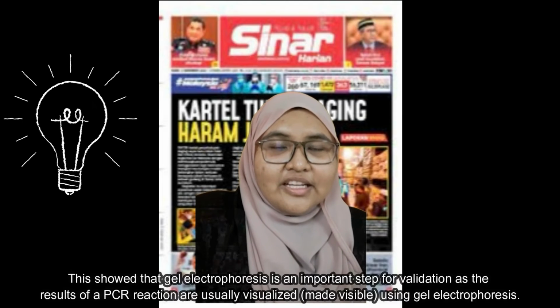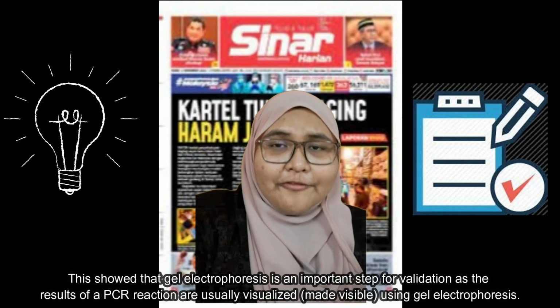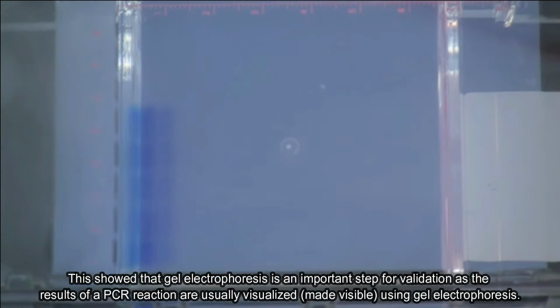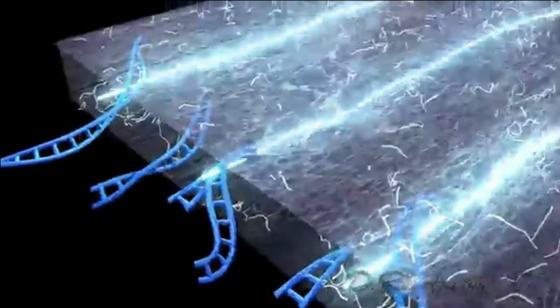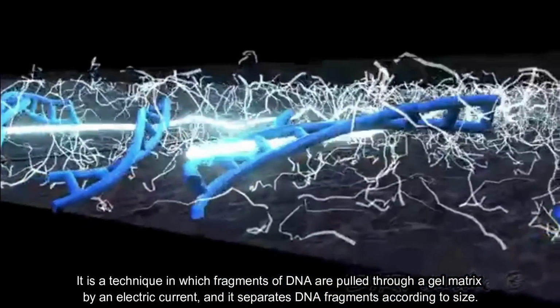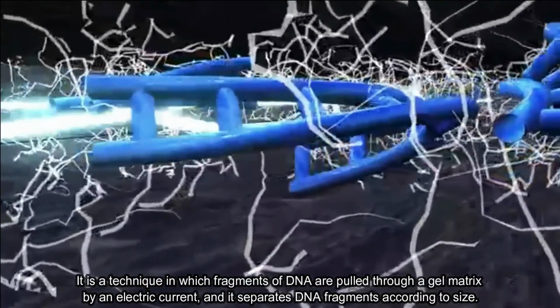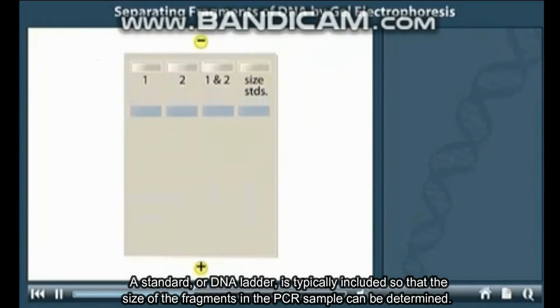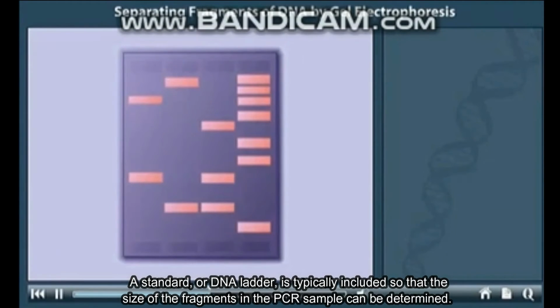This showed that gel electrophoresis is an important step for validation, as the results of a PCR reaction are usually visualized using gel electrophoresis. It is a technique in which fragments of DNA are pulled through a gel matrix by an electric current and separated according to size. A standard or DNA ladder is typically included so that the size of the fragments in the PCR sample can be determined.